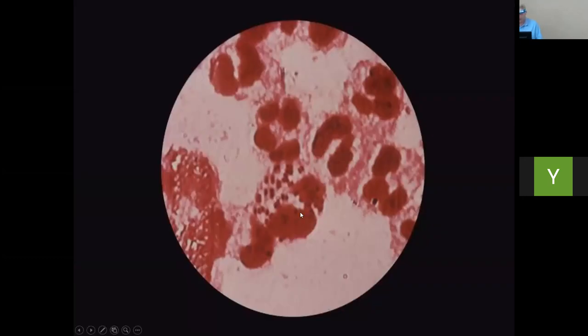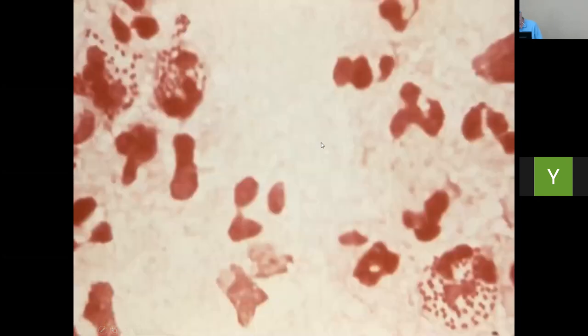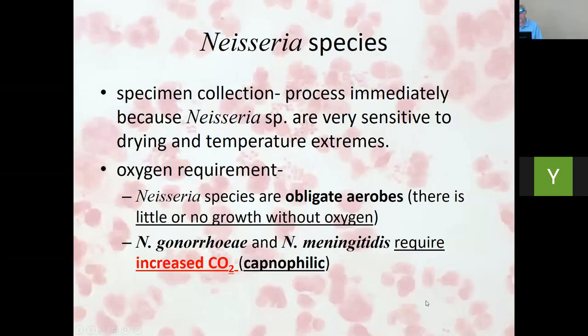Here's our gram-negative stain, and hopefully you can appreciate the diplococci here. They sometimes get described as kidney-shaped, but you can see there's a diplo. Real close up here, but you see the diplo, got a good one. This is a phagocytic cell here, and that's them in here. Ooh, there they are. That is not one there, that's the nucleus. And here they are again, being phagocytized.